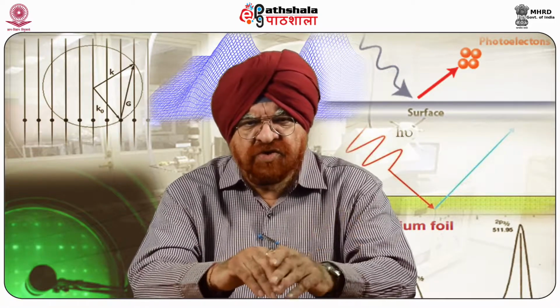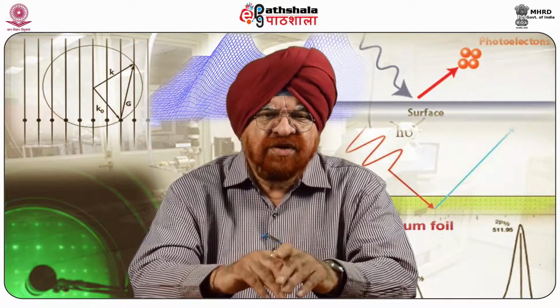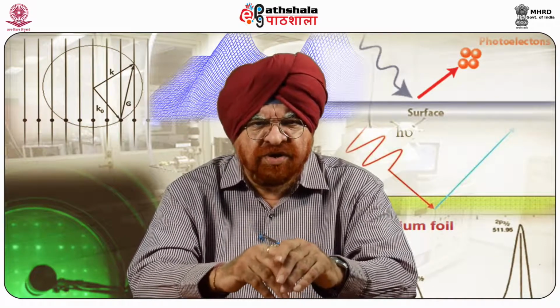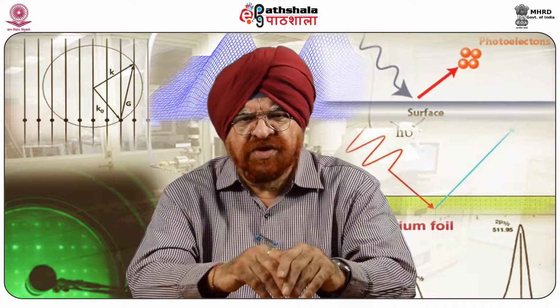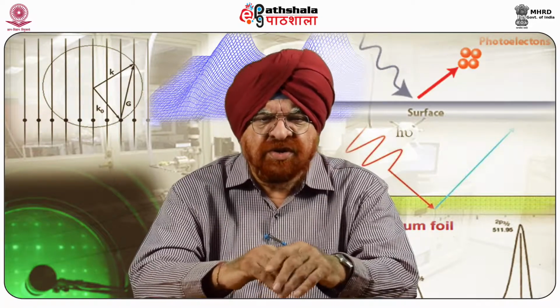For example, if you use ESCA, which we call XPS, there the sample is destroyed. So in this technique, the sample is not destroyed, and we can carry out the measurements once again. Therefore, this is a non-destructive technique to the crystal lattice or structure.